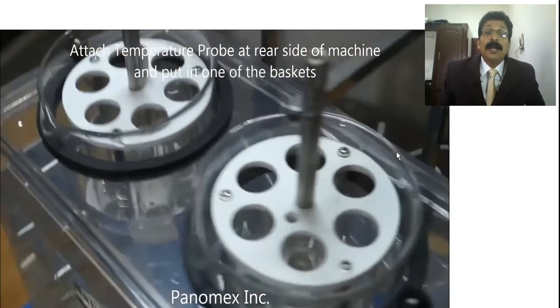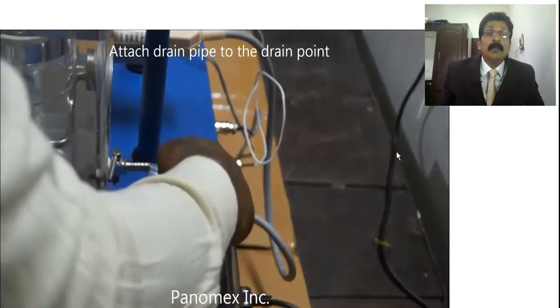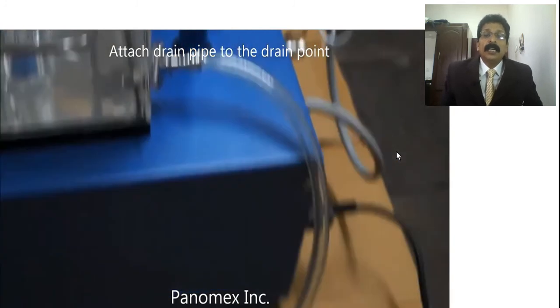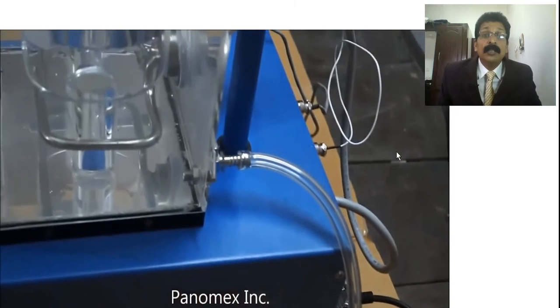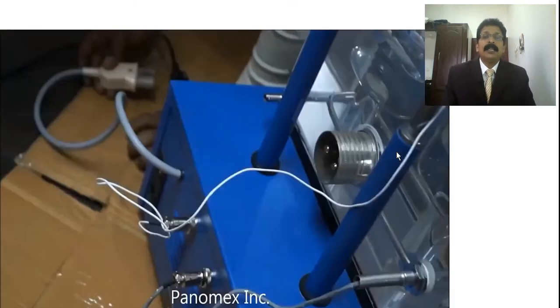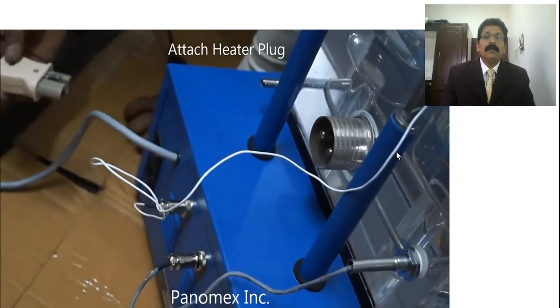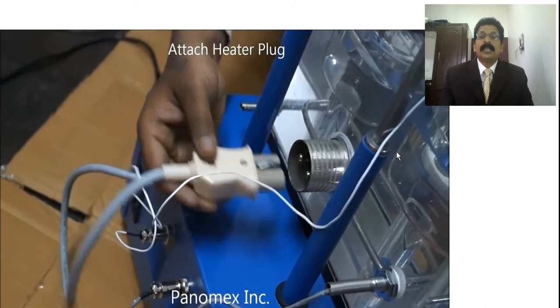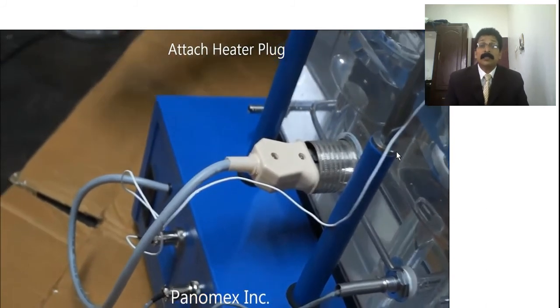You have to maintain the temperature at 37 degrees centigrade. You give water inlet for the water bath, and there is also an outlet, so that if excess water is there, it will be removed, because the level should not be more. And this is the jack which is used for heating the water bath. The water bath will also be heated separately by the coil.